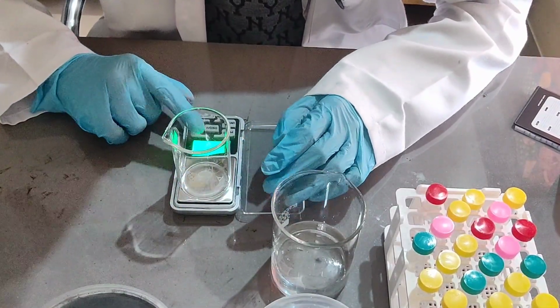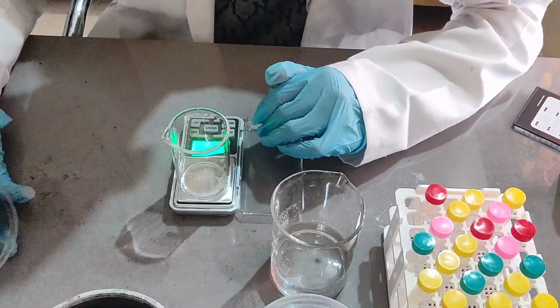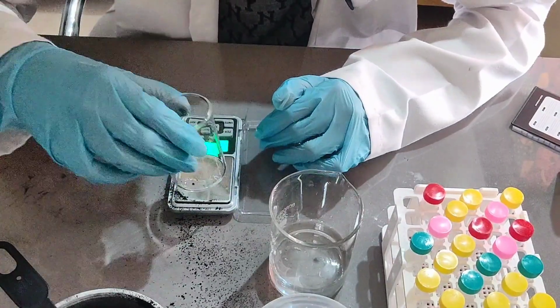Okay. You tare it. I don't know what it's called, zeroing it, might be. Oh no! I messed up.